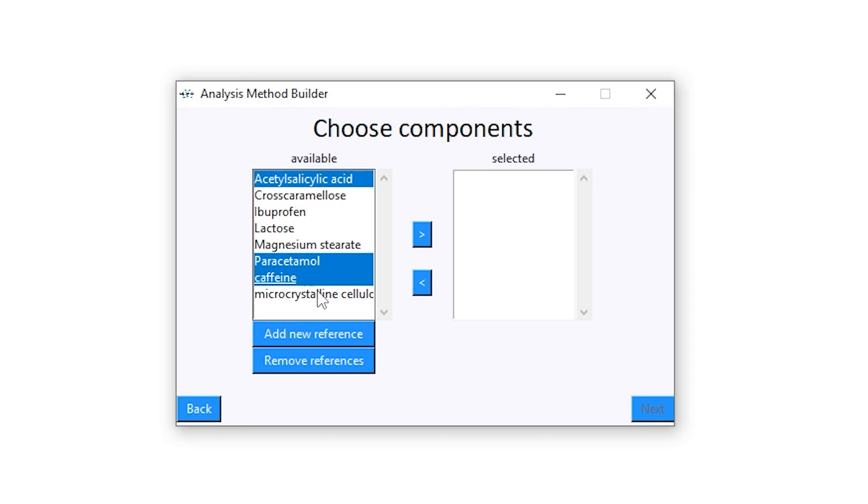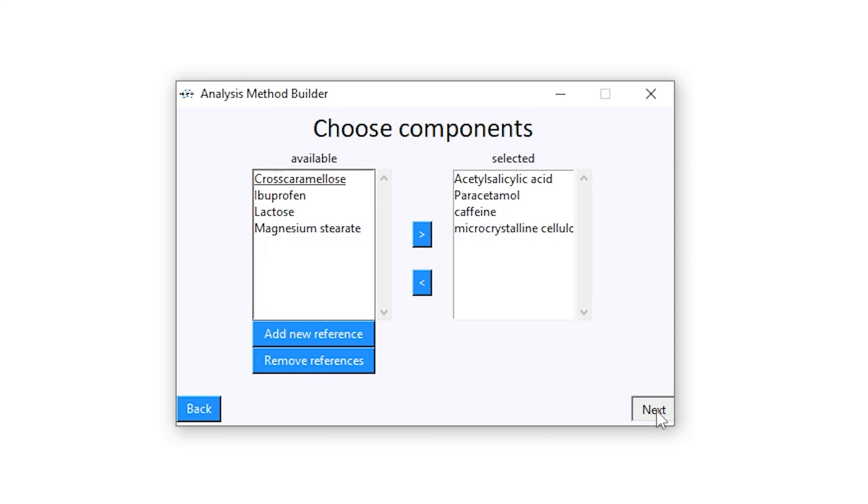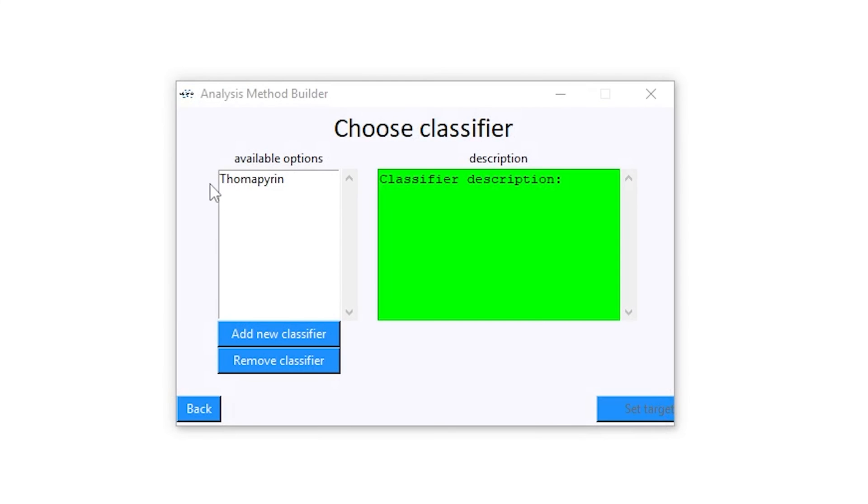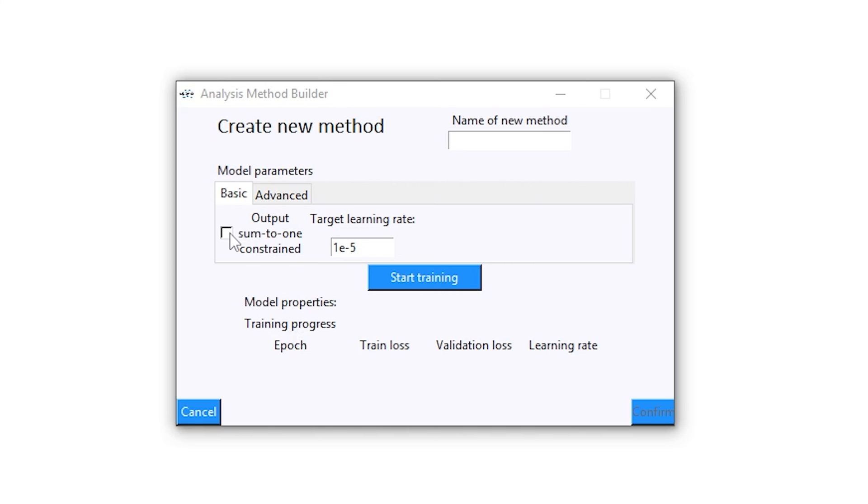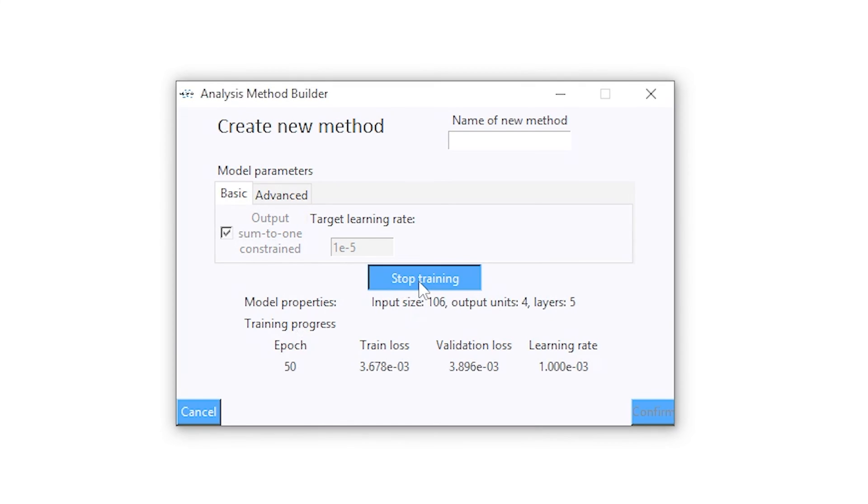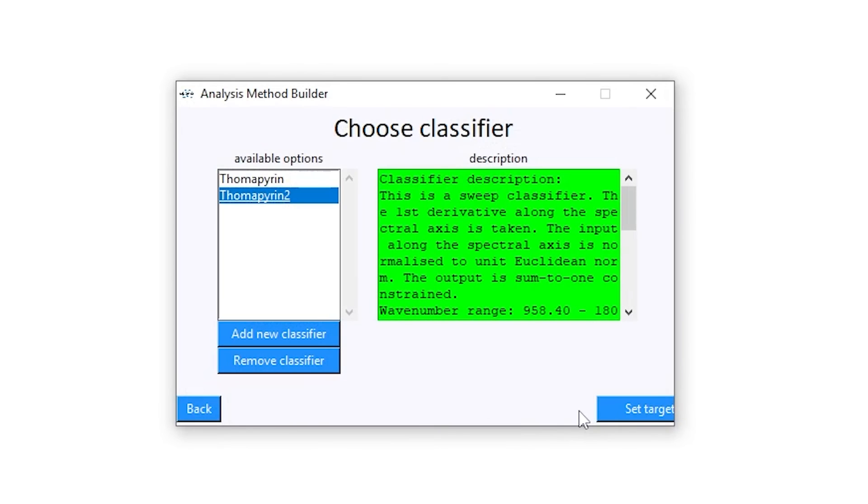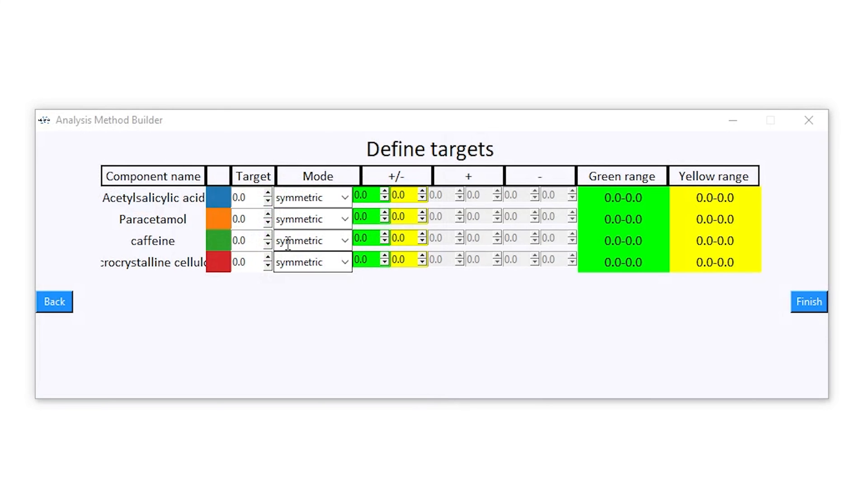This evaluation is created using a state-of-the-art machine learning approach. The user can construct evaluation models tailored to their products. All that is needed are pure reference spectra.